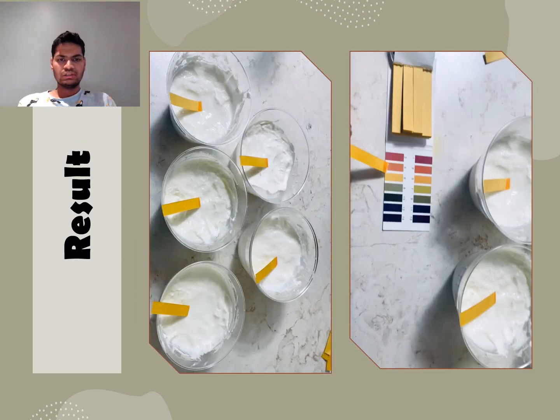Now this is the result of the pH strips, which is acidic, and that is characterized by the color change of the pH strips from yellow to orange, which indicates the acidic nature of the yogurt.